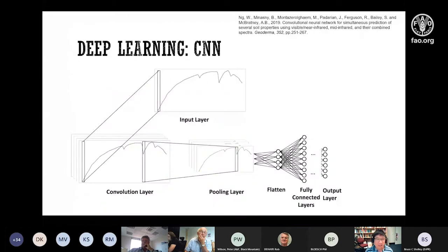So we look at this, we have this much data, so what can we do out of it? At the moment there is a lot of machine learning and smart algorithms going on, and one of them is what we call deep learning, which recognizes people's faces, like your Facebook friends. That's because they use deep learning. If you have a lot of data, they can look at very detailed relationships that may be missed in a more general machine learning method.